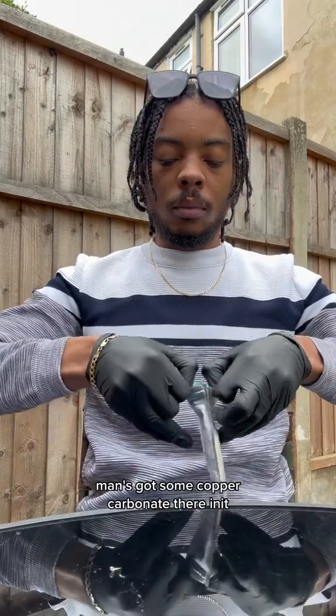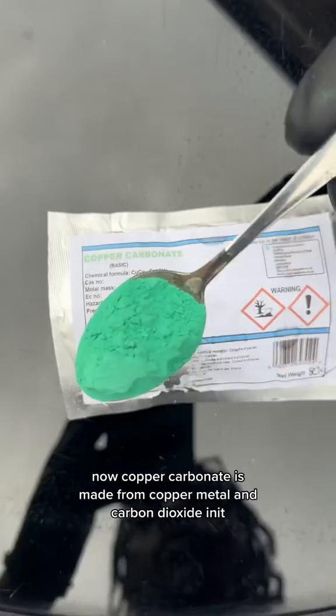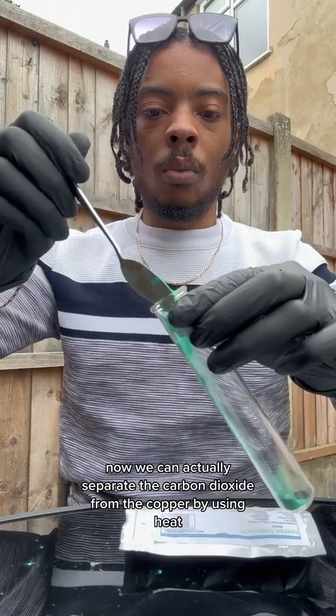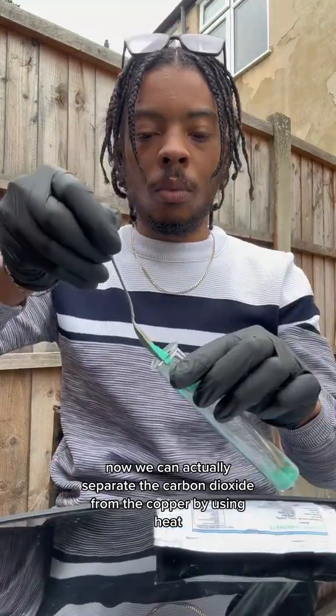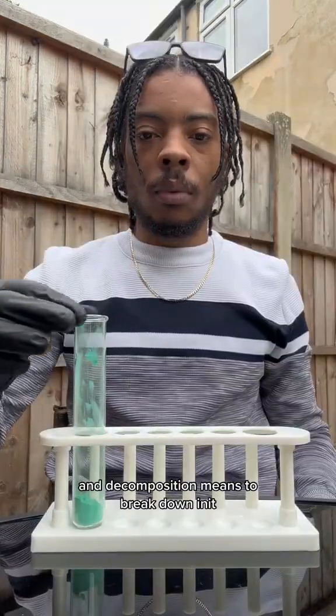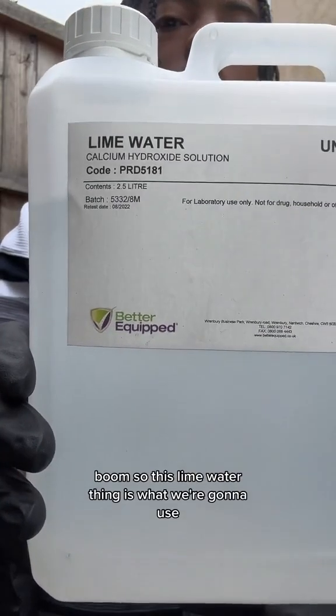We've got some copper carbonate here. Copper carbonate is made from copper metal and carbon dioxide. We can actually separate the carbon dioxide from the copper by using heat — this is known as thermal decomposition. Thermal stands for heat, and decomposition means to break down.